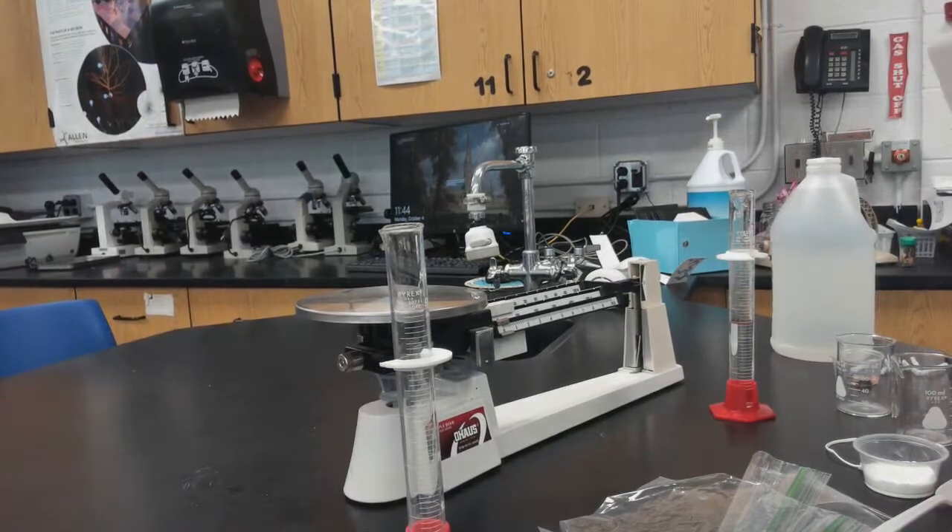This is testing the conservation of mass lab. The law of conservation of mass states that matter cannot be created nor destroyed. We're going to do a little experiment to test that.